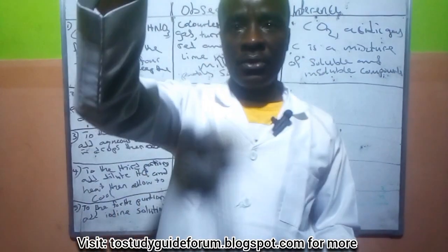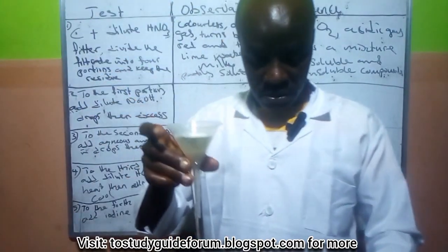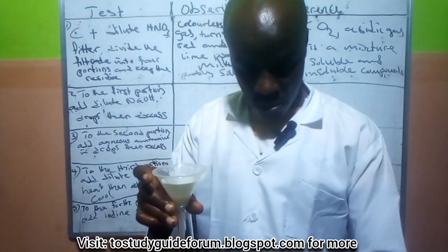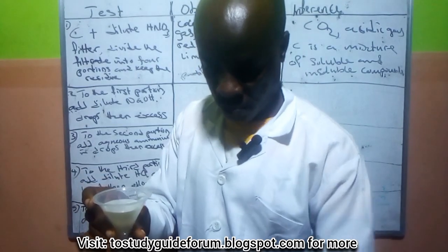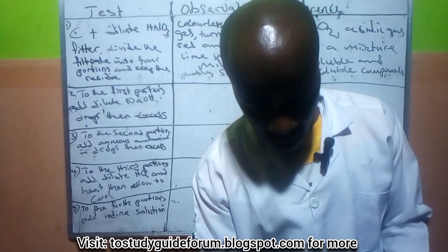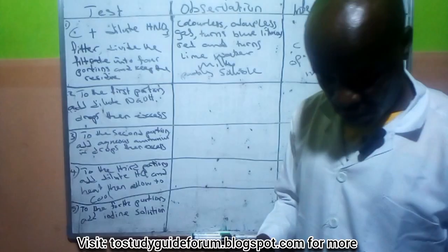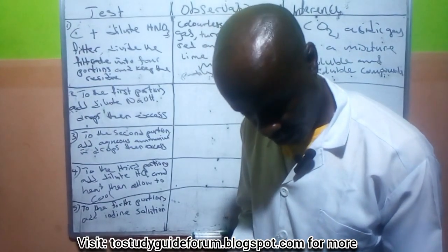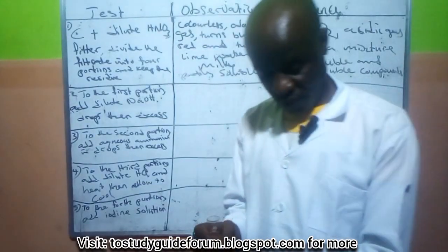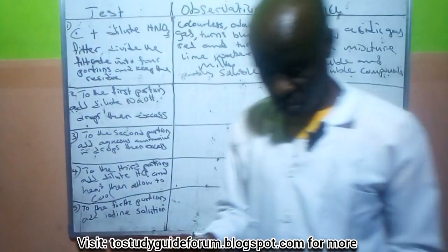So you can see that the filtrate is colorless as it's coming out. This one did not come out completely, we still have some there. So we will go ahead with the filtrates I have already made before doing this video, so that we can save time. If I were to wait for this, it would take a lot of our time. So now this is the one we're going to work with.